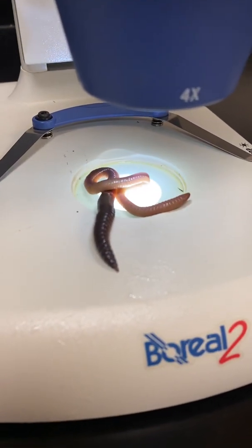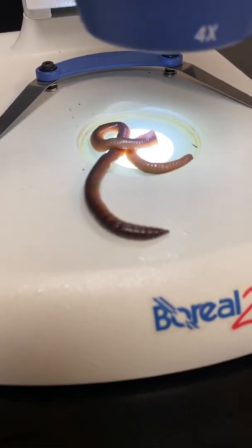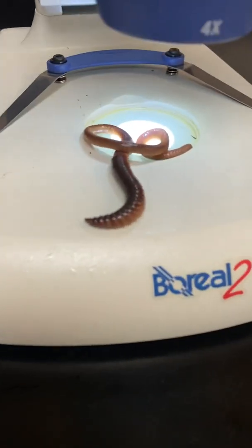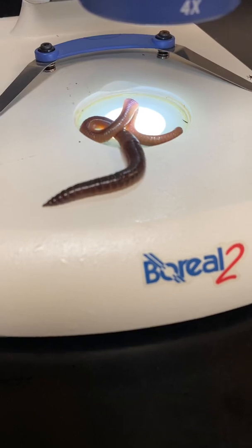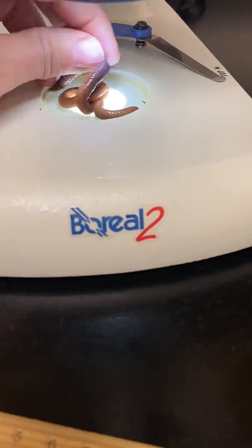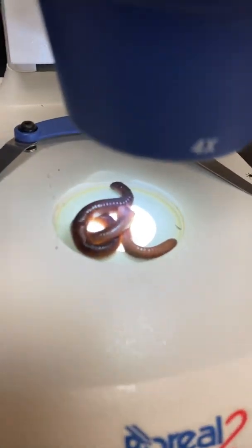Some of the classes use their phone flashlight, put them in the tray and put a cupboard on one side, a little bit more shade, and see what happens. Come back and see if he moves again.